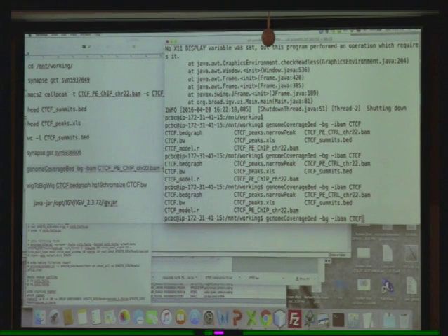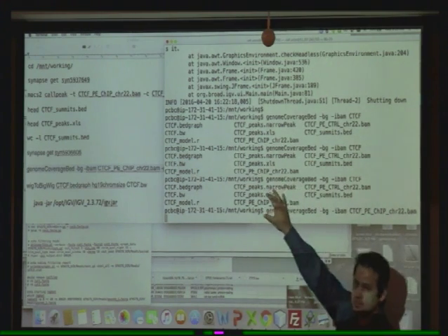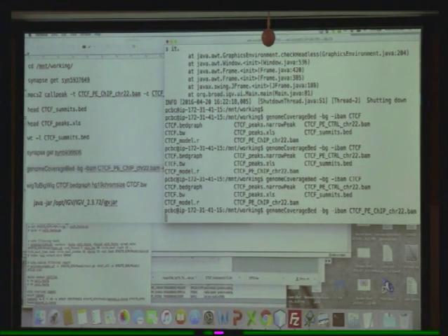CTCF, and then underscore, PE, and then it says, okay, well, what's the next character? H, tab again. That's tab complete. So you put in the first few characters, you tab, and then it finishes it off for you. And if it's unique enough, it'll finish it off. If it's not, it'll say, here's what your options are. And then just a few more characters, tab it.